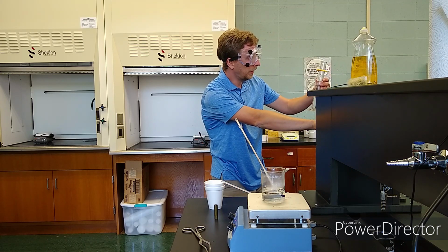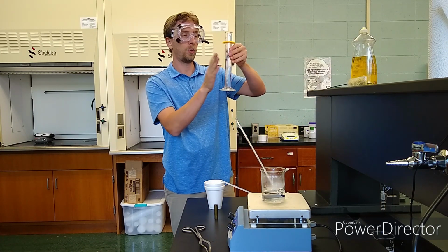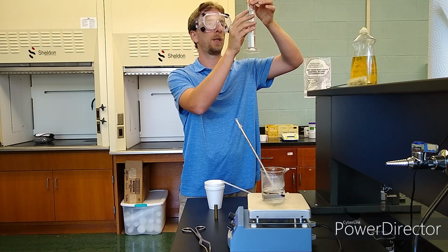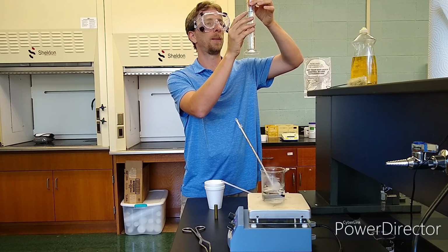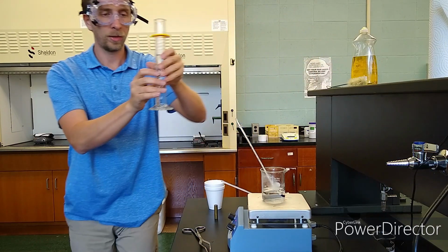All right, I'm going to measure this, and you can tell me if you agree here. Well, it's got some bubbles in there. The bottom of the meniscus says 79.8. About 79.6, 79.8. Now let me see if y'all can read this.